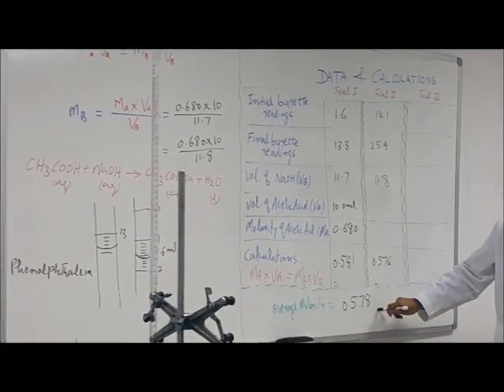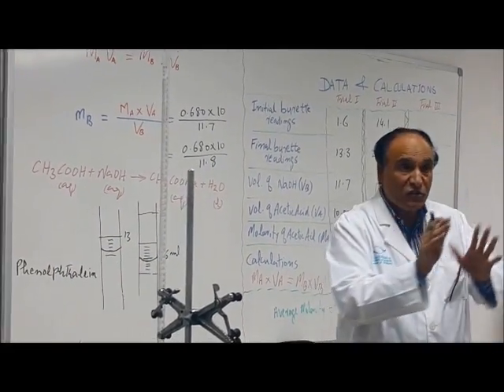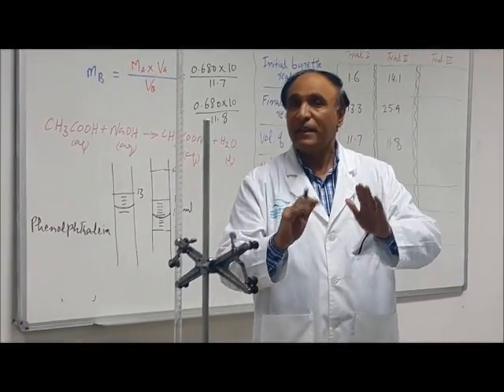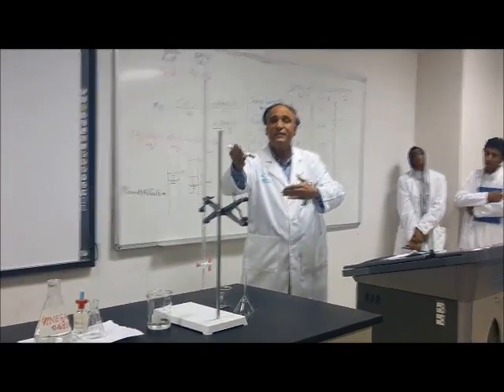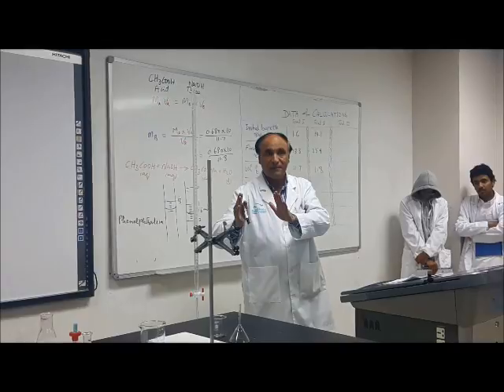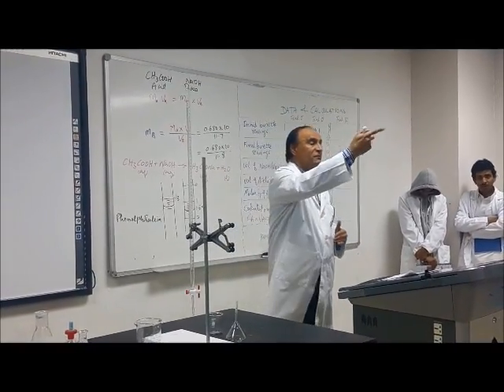Did you understand? Yes. It's a very interesting experiment. When you do it with your own hands, definitely you will like it, because you are not going to do it only for today. In future, many of you will be doing research work, and this is an essential part of research work. There are so many difficult titrations. This is a very simple one I have made for you so you can understand.